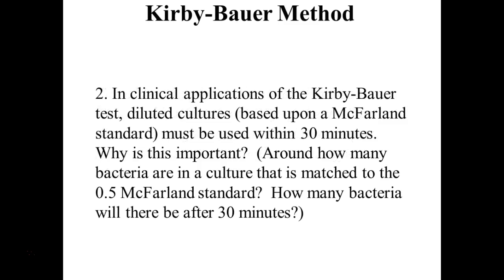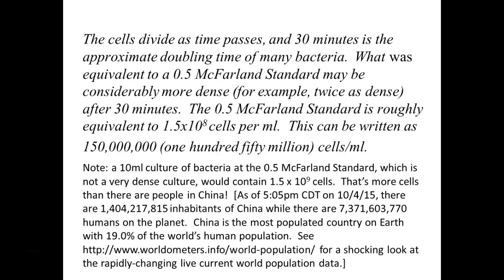In clinical applications, you would base it on the McFarland standard, and you'd use it within 30 minutes. So about how many bacteria do they say in your lab manual 0.5 McFarland is supposed to be? I think 1.5 times 10 to the 8th. Is that right? Something like that. No one wrote it down? It's on my next slide. Aha! Look, I remembered right. Wow, that's amazing today with this headache. 1.5 times 10 to the 8th. That's 150 million cells. Wow, that's a lot.